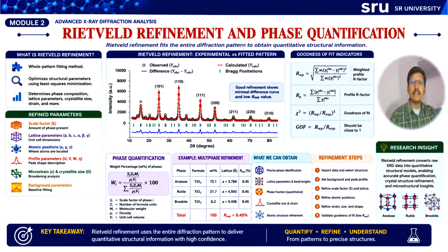In modern material science, Rietveld refinement is considered an essential tool for extracting accurate structural information from the diffraction data. The key takeaway from this slide is that Rietveld refinement transforms the diffraction pattern into precise structural information with high confidence and accuracy.